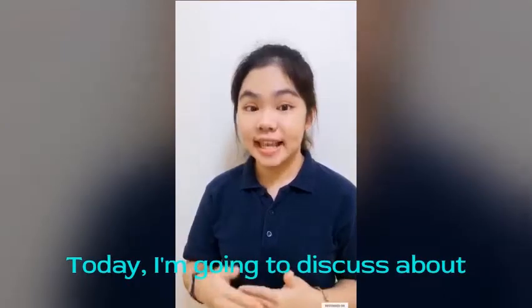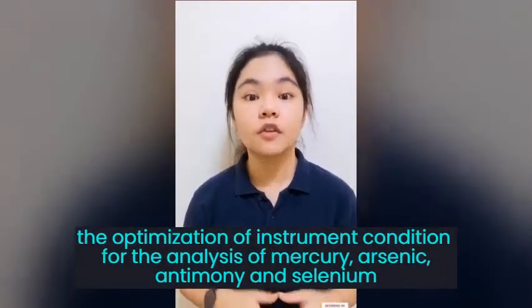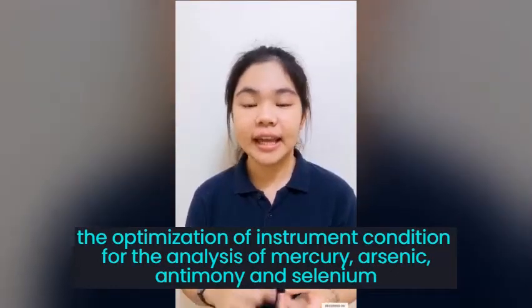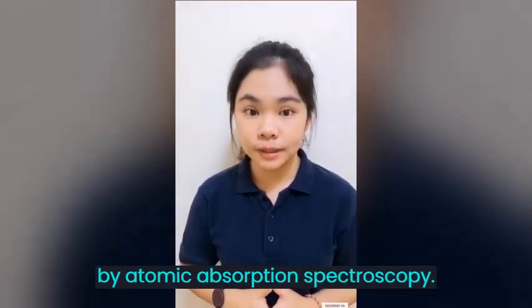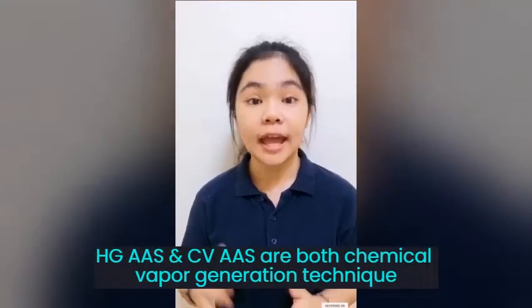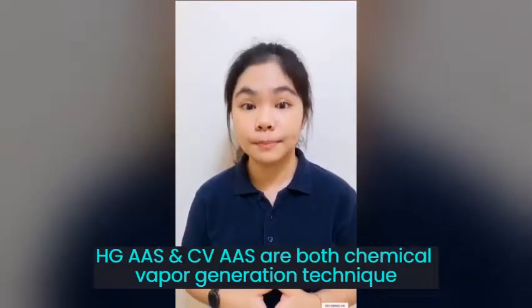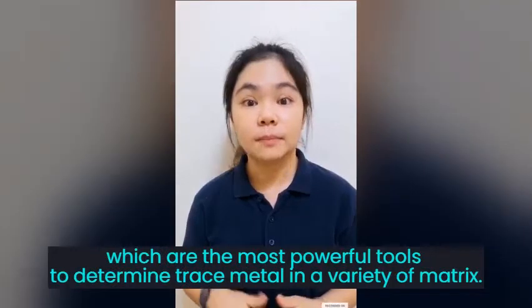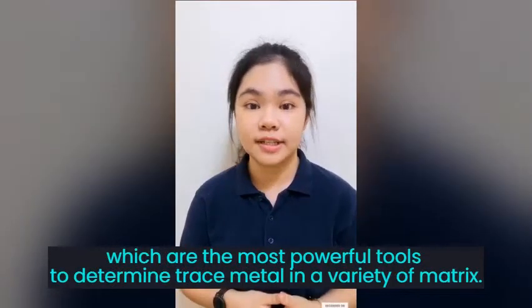Today I'm going to discuss the optimization of instrument conditions for the analysis of mercury, arsenic, antimony and selenium by atomic absorption spectroscopy. Hydride generation atomic absorption spectroscopy and cold vapor atomic absorption spectroscopy are both chemical vapor generation techniques, which are the most powerful tools to determine trace metals in a variety of matrices.